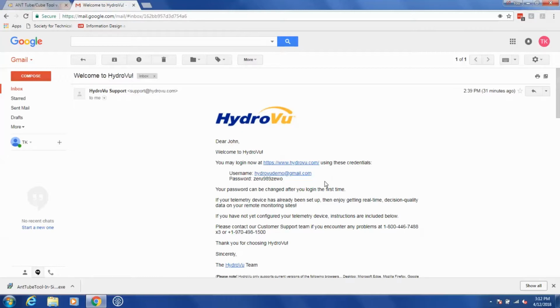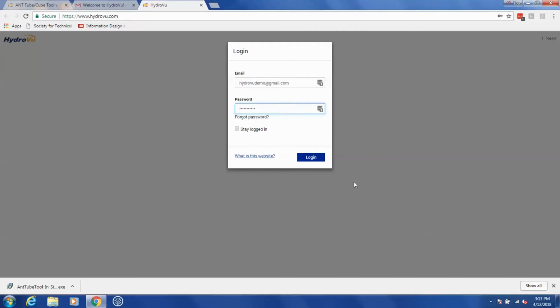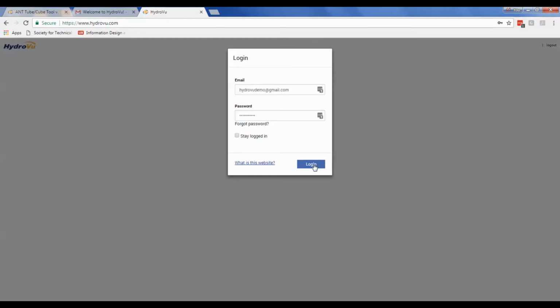The welcome email has some key information to get you started. First is your username. Please type it in exactly as you see it entered in the email. Second is your password. This can be changed once you log into the account. Make sure you enter the URL correctly. This is at www.hydrovu.com. It cannot be accessed from the login on In-Situ's website.